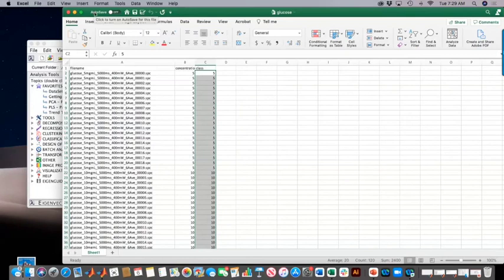I created an Excel spreadsheet for an experiment file reader where, as before, we had our file names and then we had concentration. I just took this concentration and copied it over into something called class. When you import that, the import tool shows you the first view of it, and you can specify that as a class.